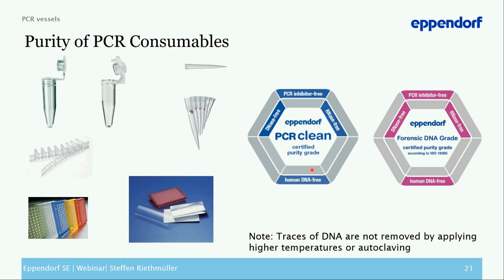And yeah, just this little story underlines how important it is that the consumables are free of human DNA, and this accounts to the tubes and plates, but also to the tips.